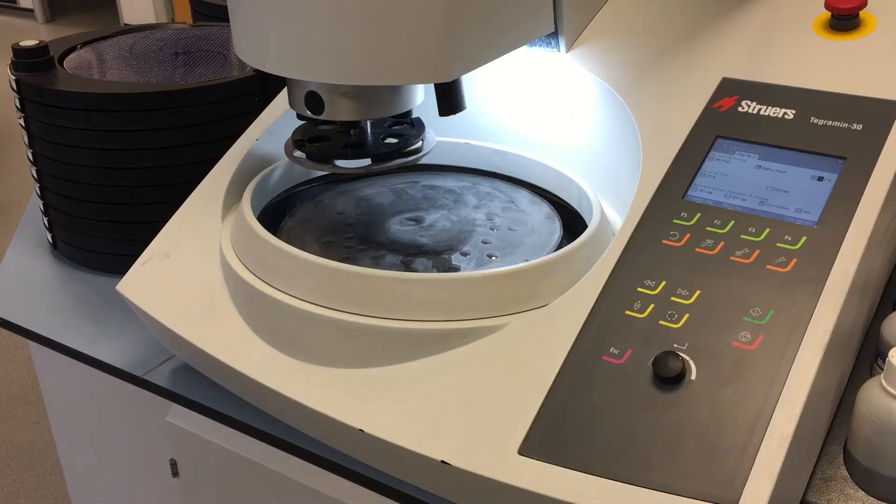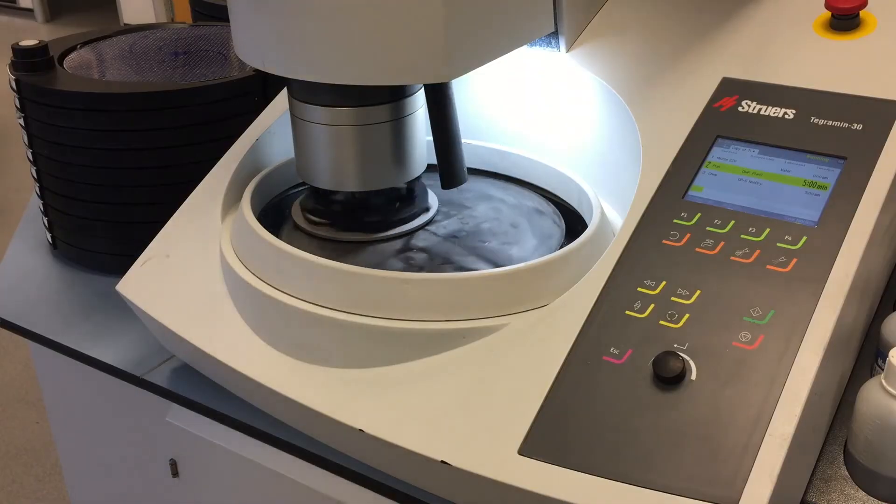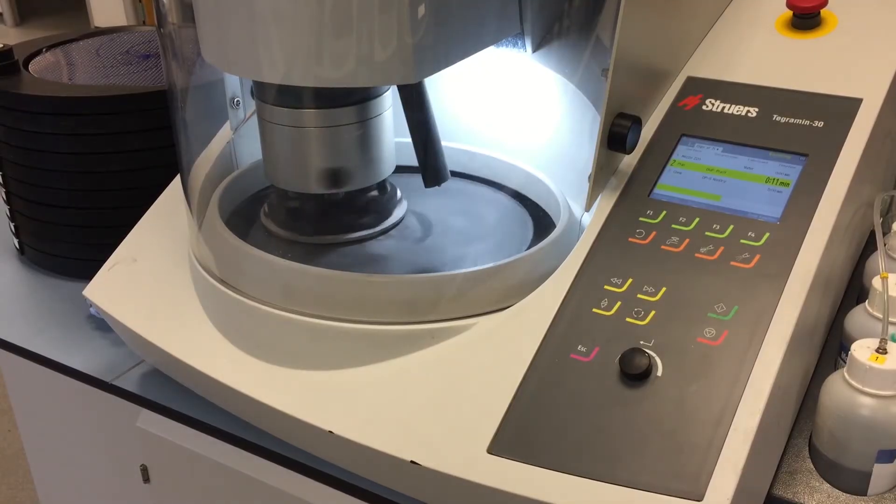Before we start, you'll notice there is a rubber ring on top of the mover plate. This is so we can use the Lathermin, which is our automatic cleaning machine, which we will show you in a short while. As we finish this last step you'll just be able to see the diamond slowly dripping. At the end it's important to make sure there is no excess diamond, because when the machine stops we have a sniff function which will pull back any diamond that is ready to drip, making sure we don't contaminate the cloth.